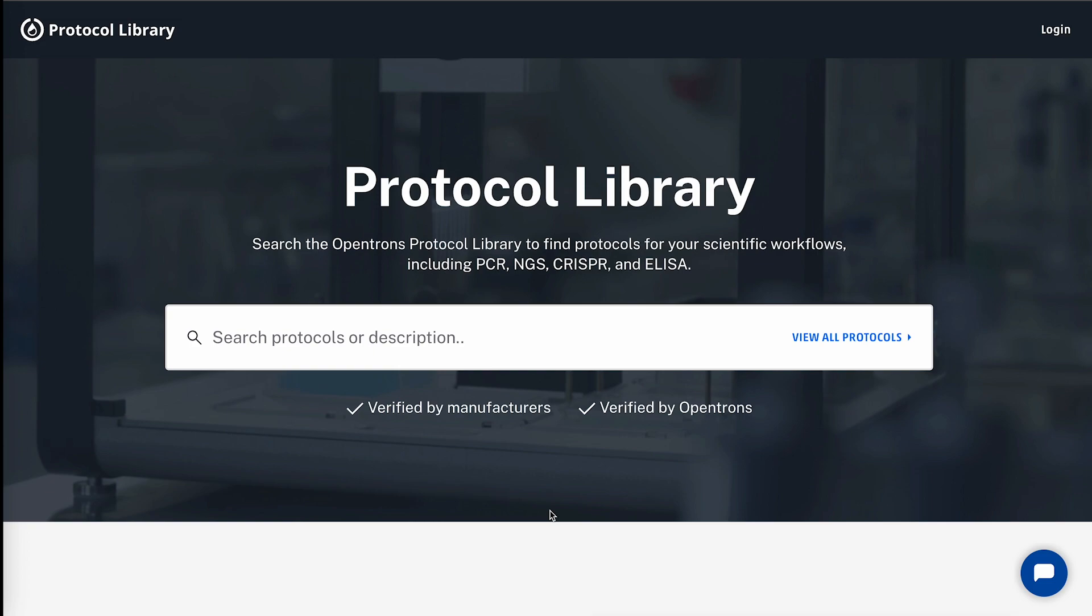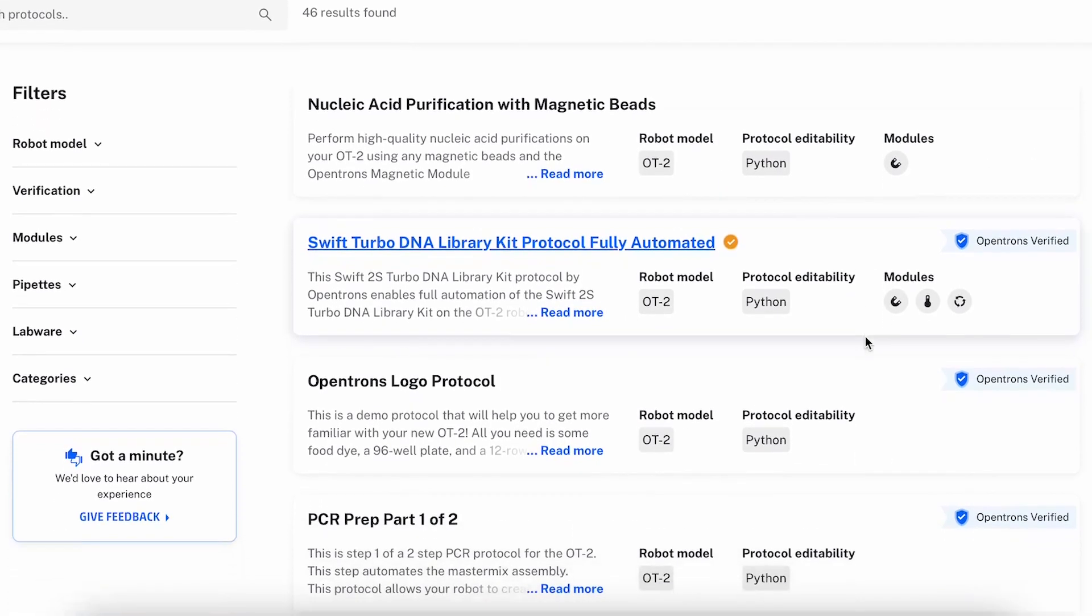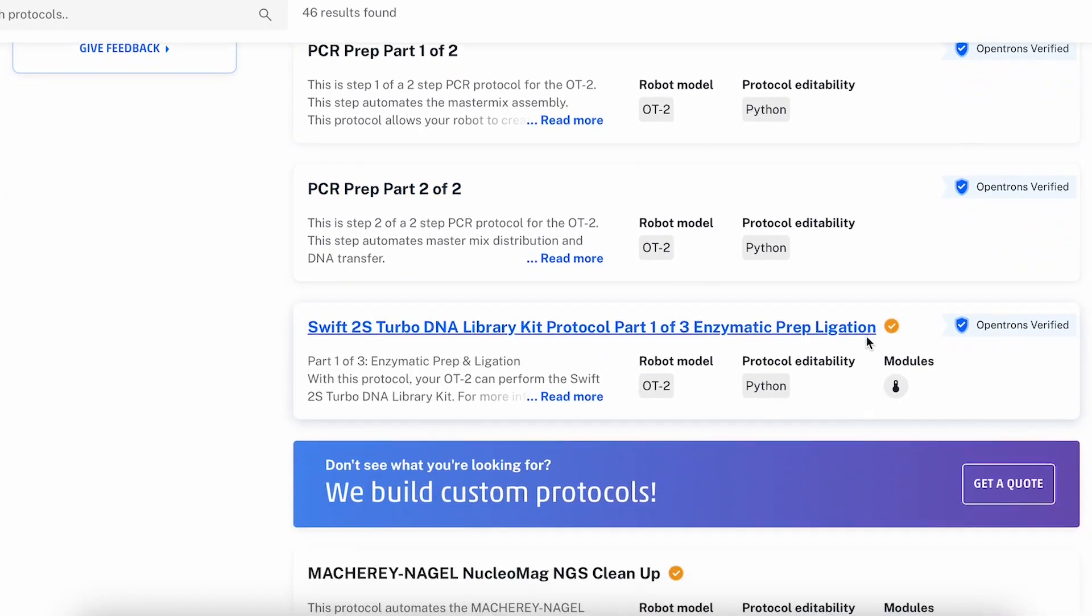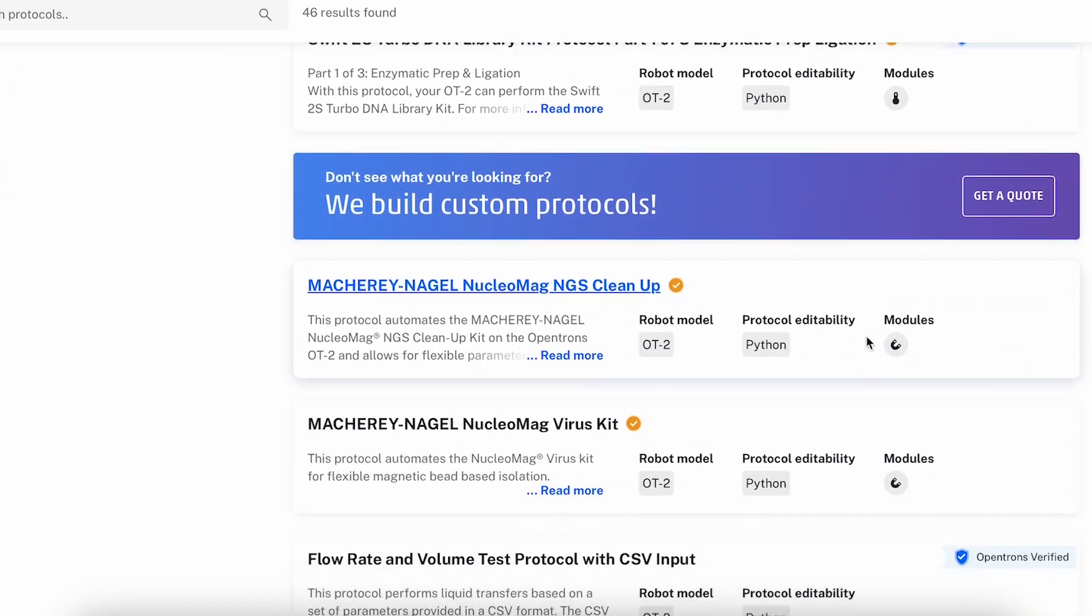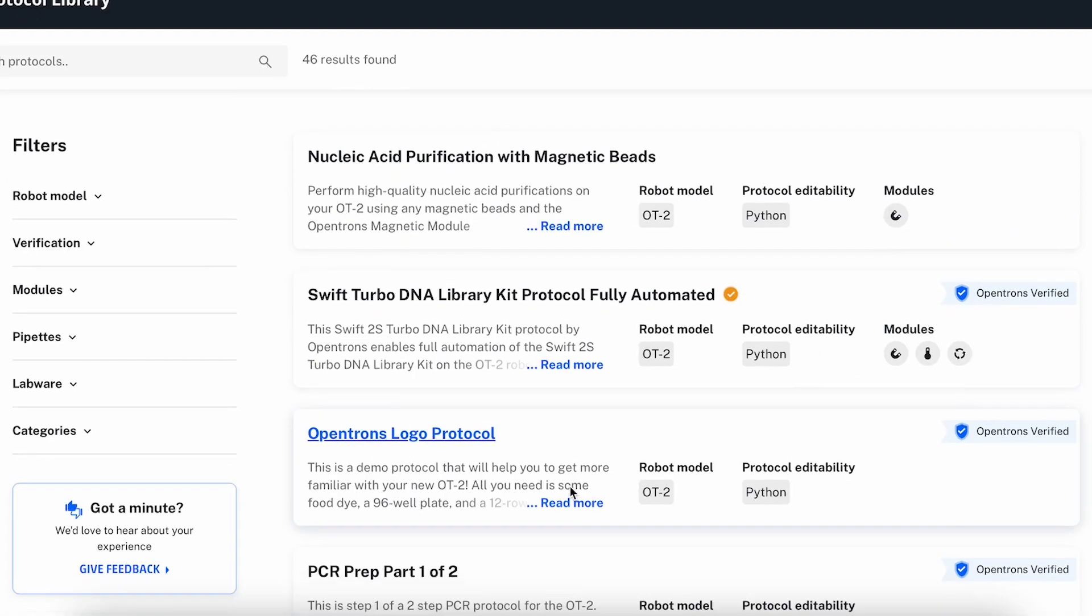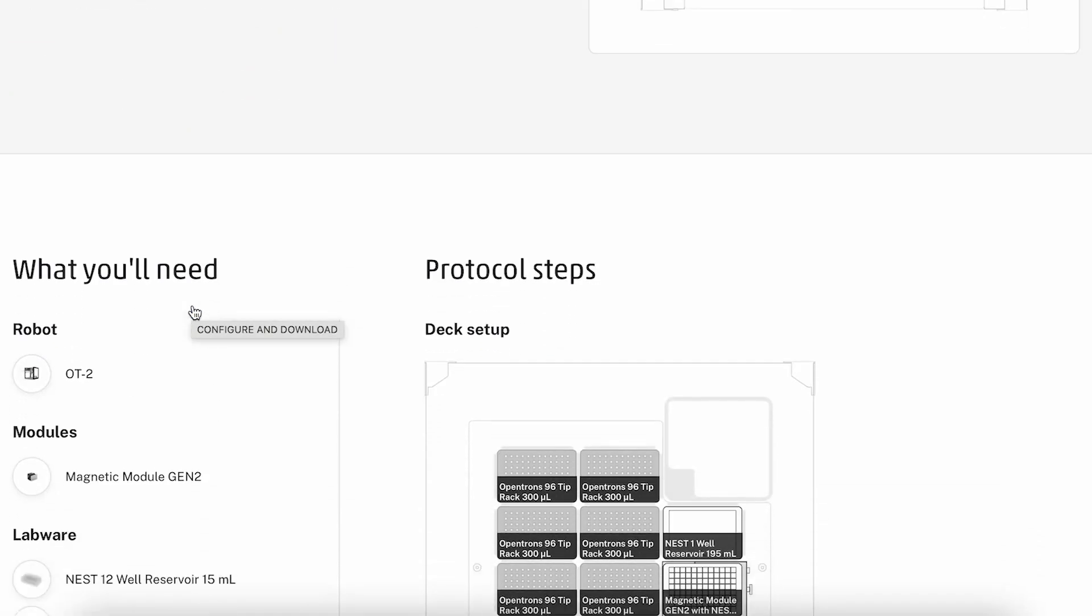First, we will navigate to the protocol library. A link to the protocol library will be in the video's description. When we're at the library, we can browse through the extensive collection to find a protocol that fits our needs. OpenTRONS simplifies complex procedures to ensure accuracy and reproducibility.